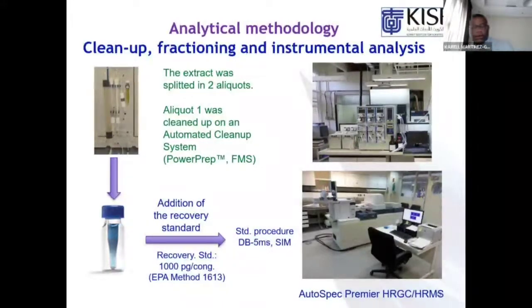I think you have seen this picture in the previous presentation. Anyway, this is our high resolution system, where we do dioxin-like PCBs, marker PCBs, and dioxins mainly, and we keep the other analytes for the GC-MS/MS or the GC-MS system in our lab.